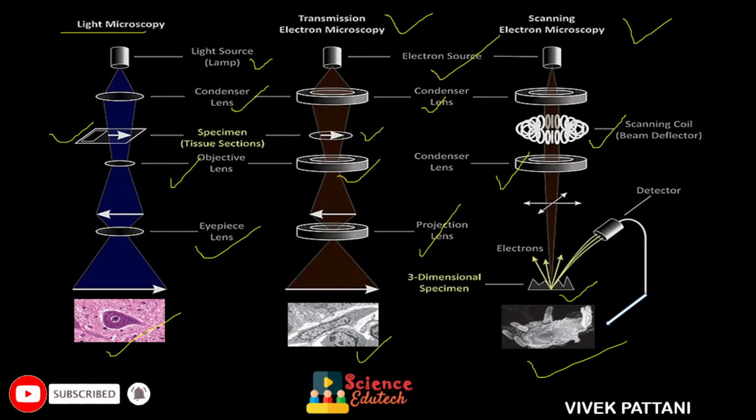So what is the basic difference between transmission electron microscopy and scanning electron microscopy, which I'm going to discuss now?